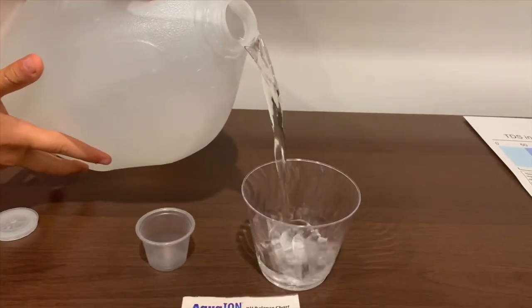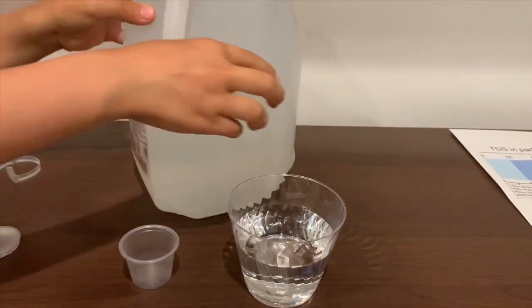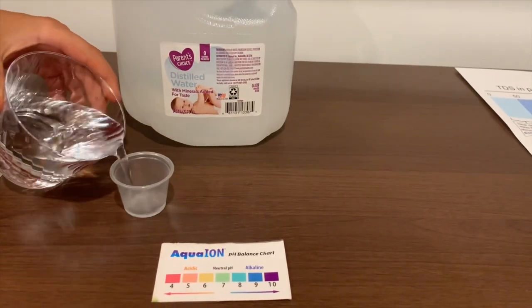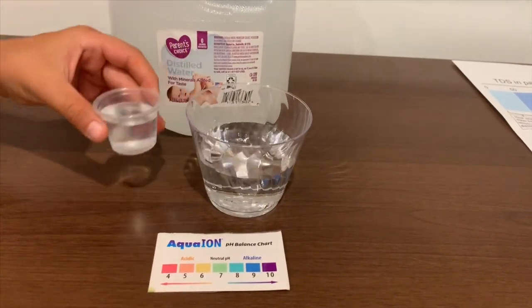Let's pour some water in. Since this bottle is too big to pour in the pH cup, I'm going to use the TDS cup to pour into the pH cup. This is a little too much for the pH cup, so let's pour some back into the TDS.